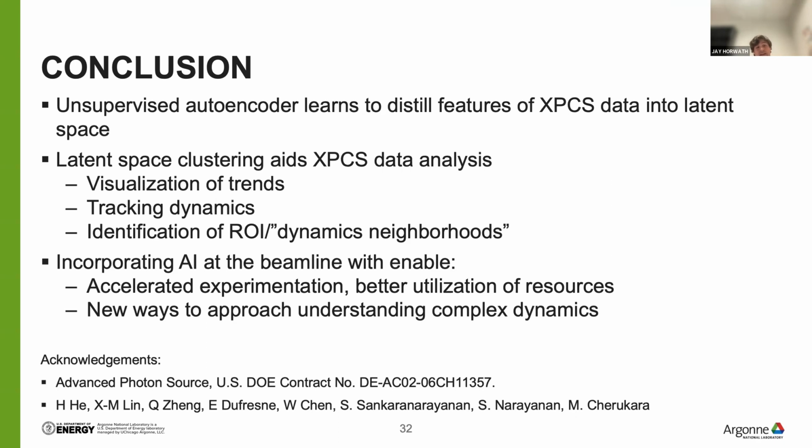behavior. And then finally, the main point of this is that hopefully by incorporating AI at the beamline, we'll be able to accelerate science and be able to fully utilize the experimental capabilities that we'll have after the APS-U. So thank you for your attention.